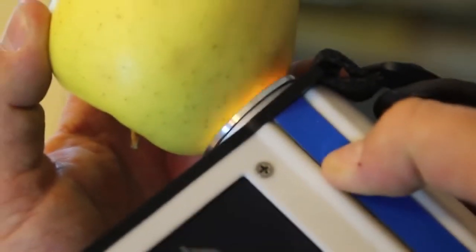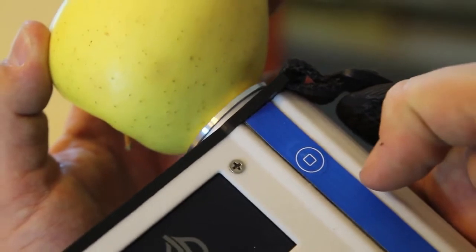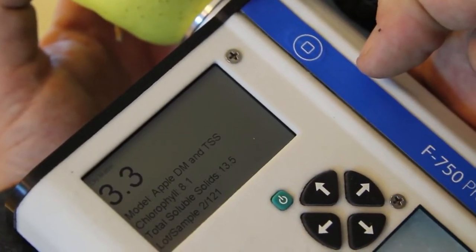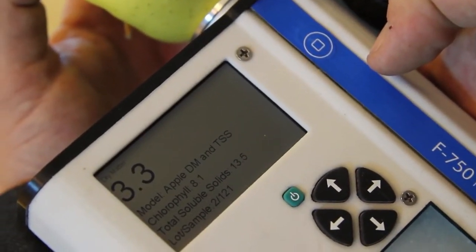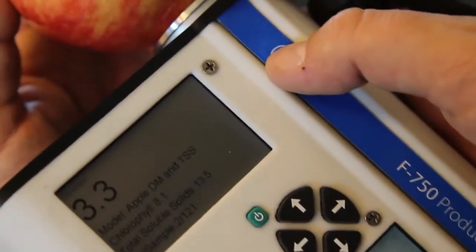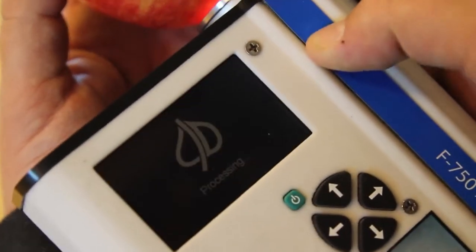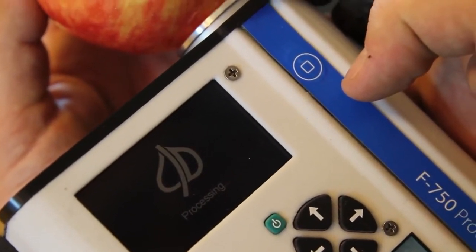To take another measurement, just place another apple on the top of the F750 and press that same thumb button. We'll do it one more time. Again, I'm just pressing the thumb button.